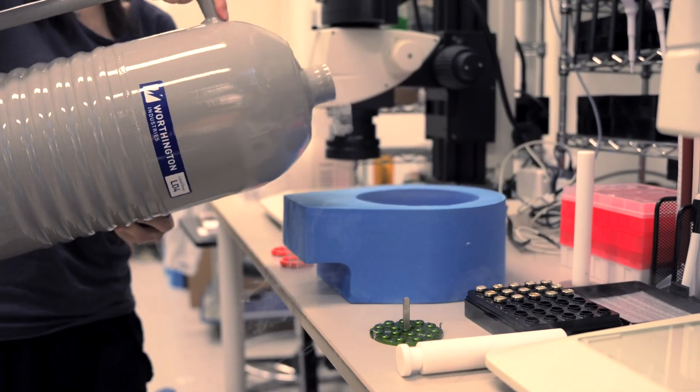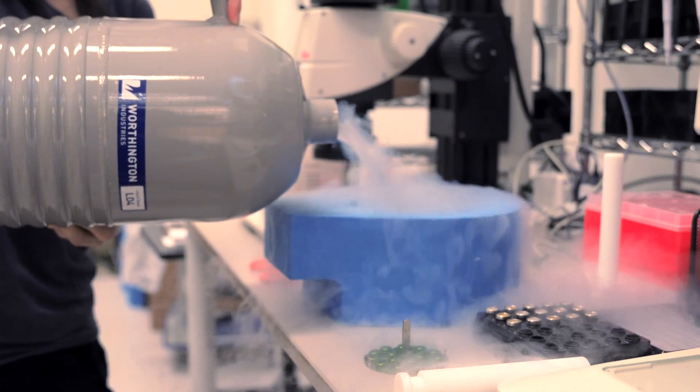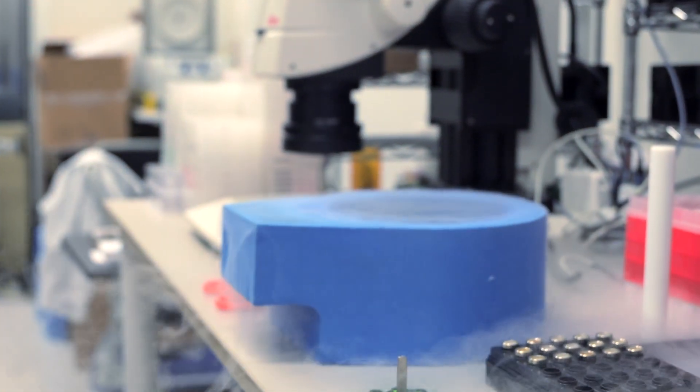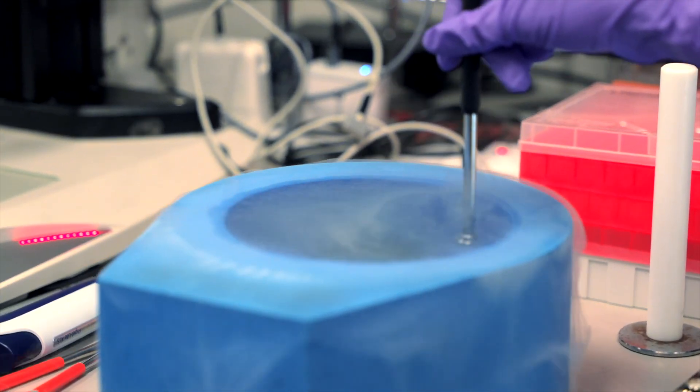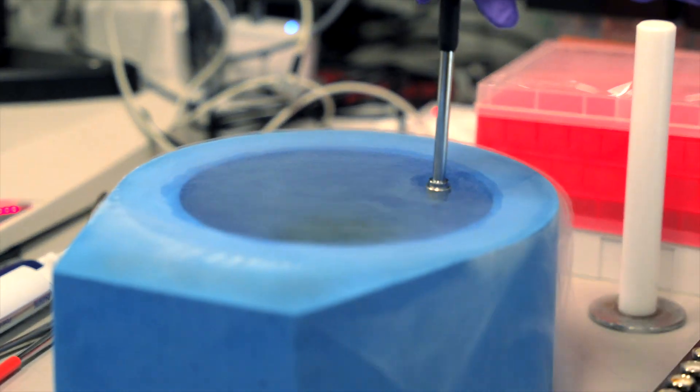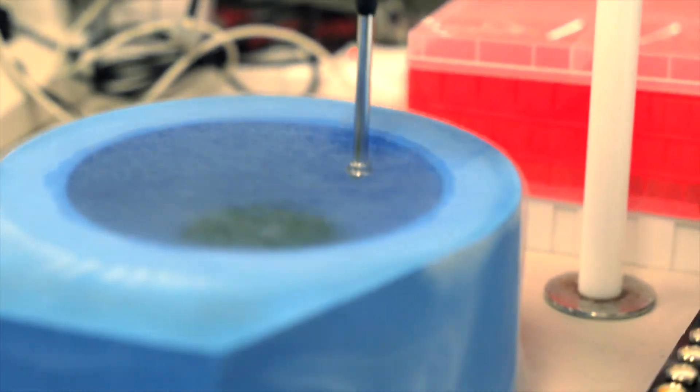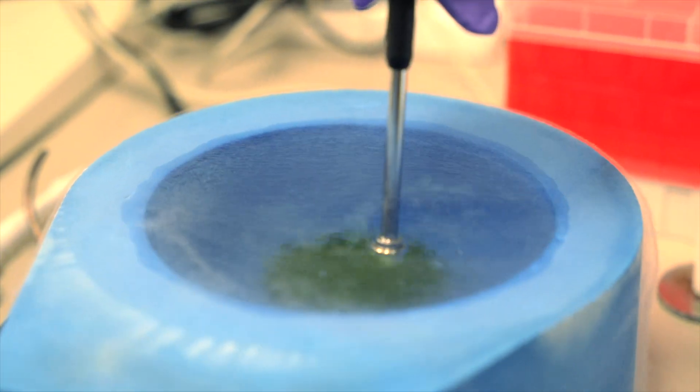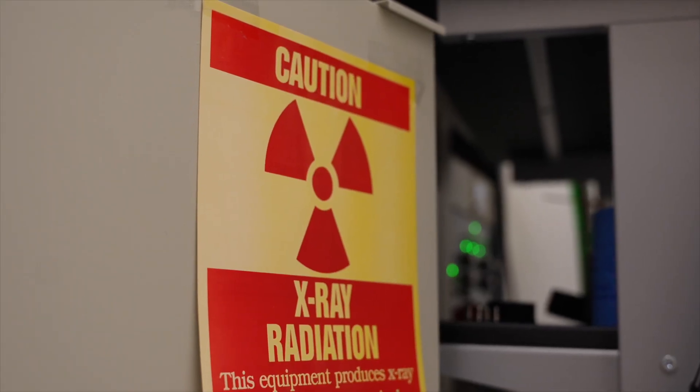Once we have the crystal in the loop, we flash freeze it in liquid nitrogen. This stuff is cold. About negative 200 degrees Celsius cold, or minus 300 degrees Fahrenheit. This instantly stops the evaporation process and preserves the structure of the crystal, literally freezing as much of the molecular motion as possible.